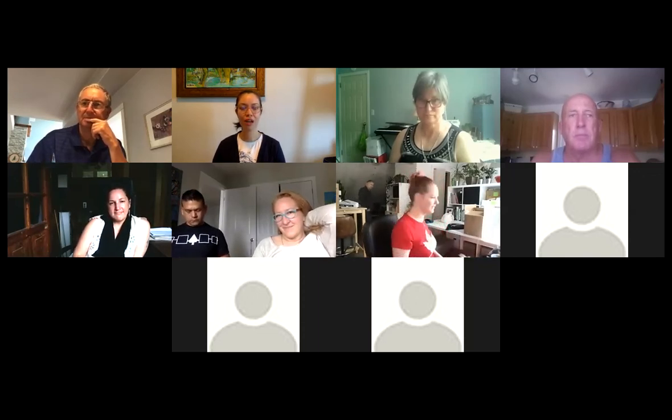And just know that we do all the quality assurance manually right now. So if you ever get an email from me saying an observation looks a little funny, then that's totally normal. I usually check them weekly with the help of a couple of other people from Water Rangers. So if you're unsure about something, you can totally reach out to us, or otherwise we'll double check everything.